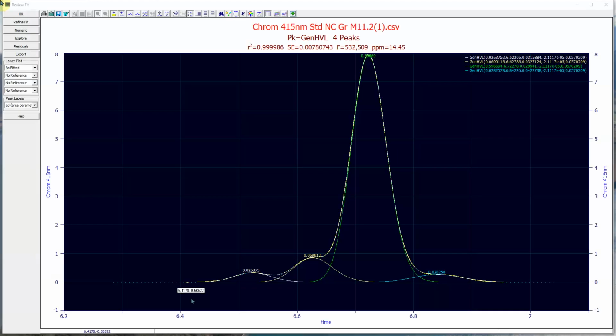While I'm doing this, I'm going to show you a little bit of qualitative analysis that is very easy to do with this kind of modeling. If you look at each of these individual 4 peaks, it's not very hard to see a specific zone of that peak that is very likely to be just a single component. And in this first peak, we would stay near the center, stay away from where the two peaks overlap. In the second one, we would do much the same. In the third, we'd stay very near the apex, and in this fourth one, we would go out a little bit further toward the tail.